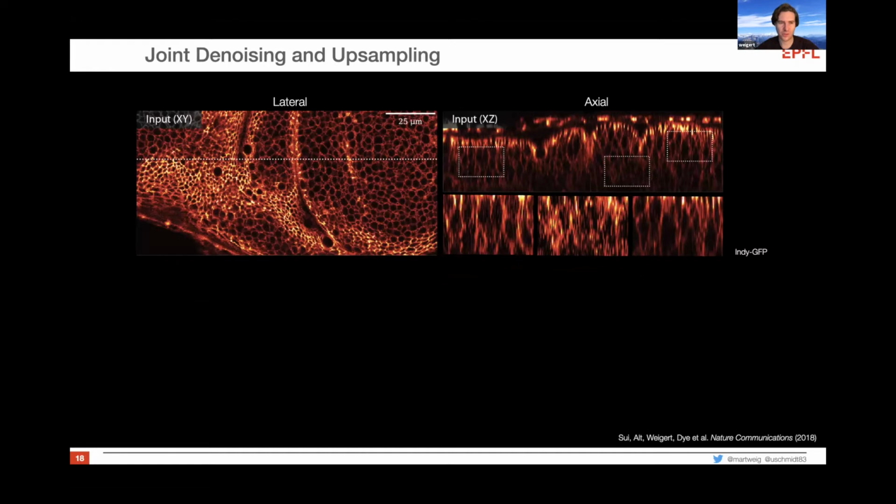And they, of course, wanted to do the imaging for quite some time. So they imaged several hours of that with a very high succession of stacks time-wise. And of course, then they were limited in the SNR that they could achieve and the actual sampling. So they had to do very, very coarse Z steps with very low camera exposure. And those were the stacks they were getting. And they were not sufficient to really trace out every one of those membranes.